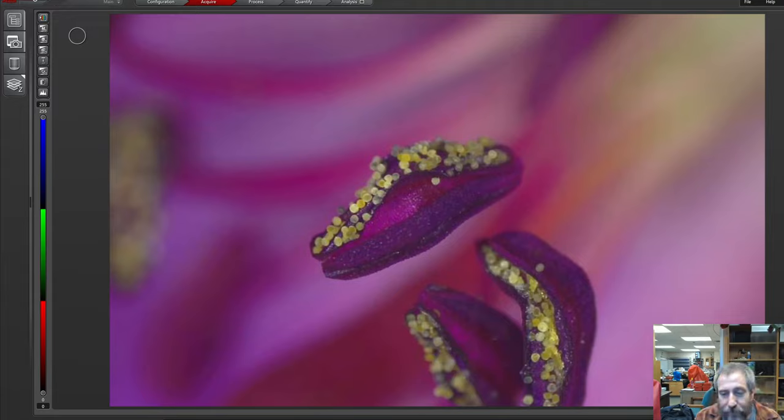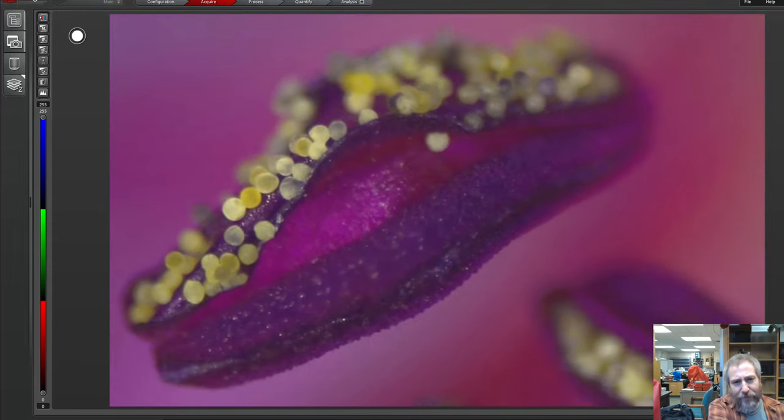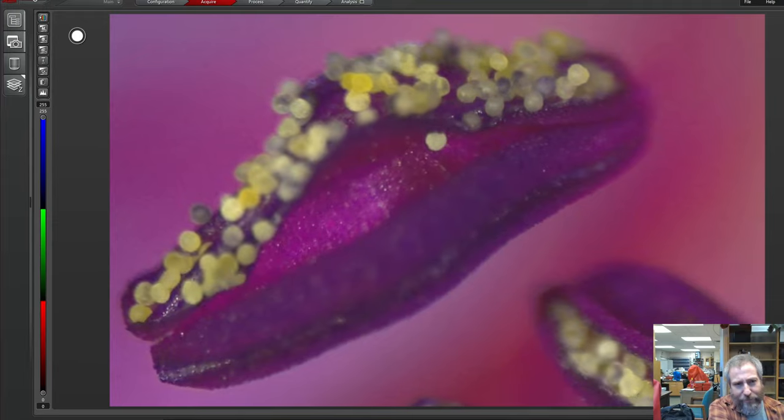Diatoms are awesome. Yeah, I agree. But I think sometimes people want something with a little bit more color and maybe something they could actually understand a bit better. I don't know. Everybody knows what pollen is. It's the stuff that makes you sneeze, stuff that bees collect.